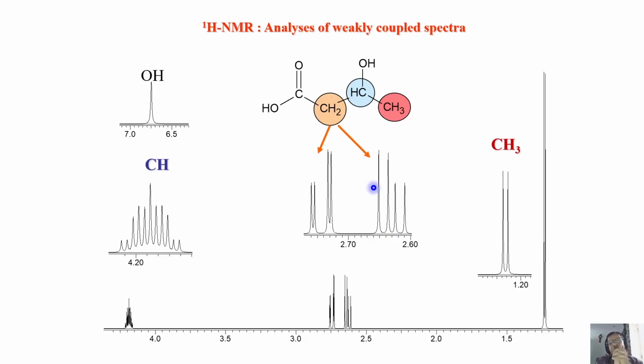First conclusion you have to draw. If they were magnetically equivalent, chemically equivalent protons, this should have split each line of the quartet into a triplet pattern. But I did not insist on that. I didn't say that. So what do you conclude from my statement?